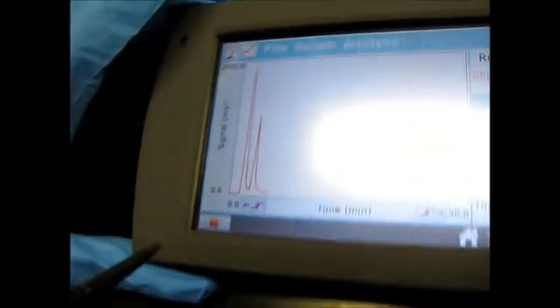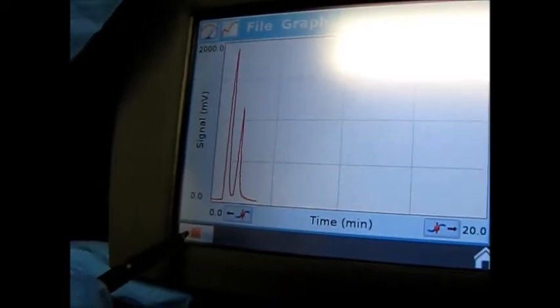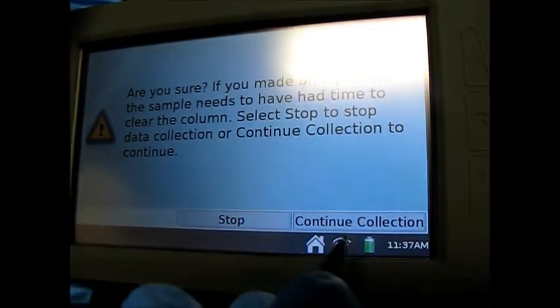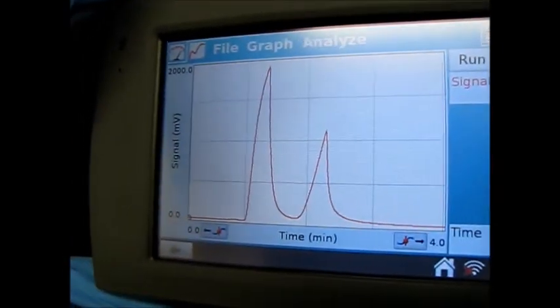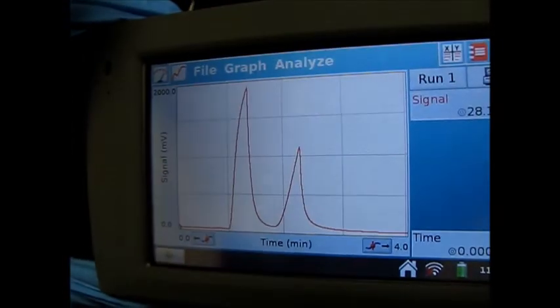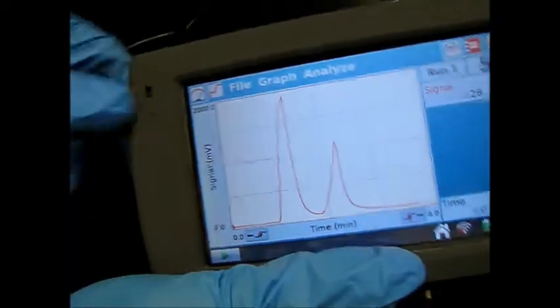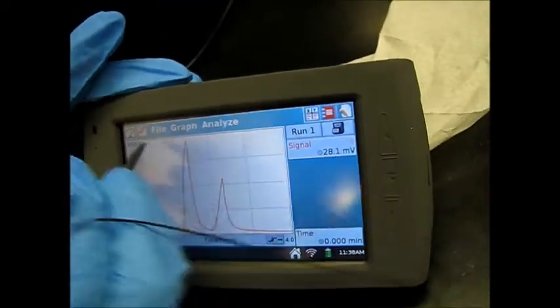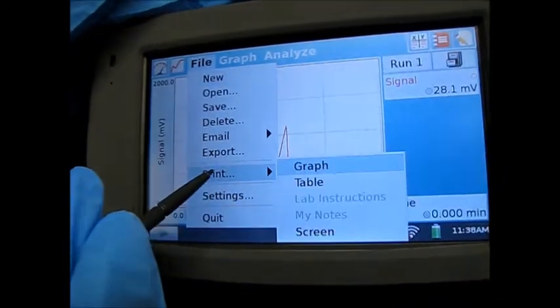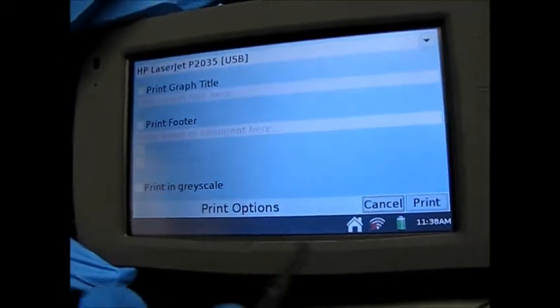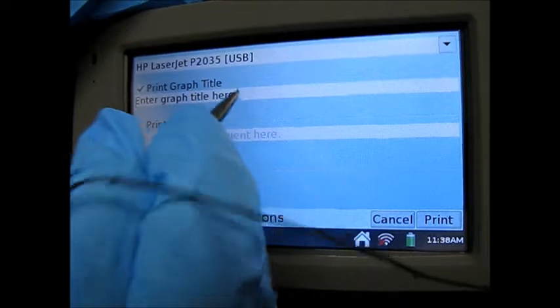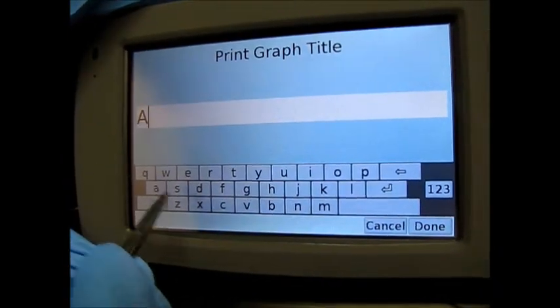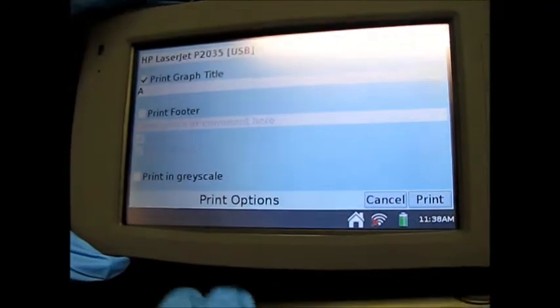So now that we're done, we're going to now press stop. So this is what we ended with. So now we're going to now go and take this and we're going to print it out. We're going to remove it from the USB. How I'm going to print it is I'm going to click file. I'm going to say print. I'm going to say the graph. And then I'm going to enter the name. Enter graph title. I'm simply just going to call this A. And then I'm going to go and print it.